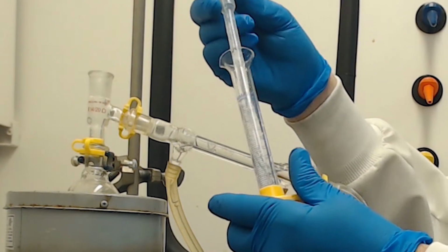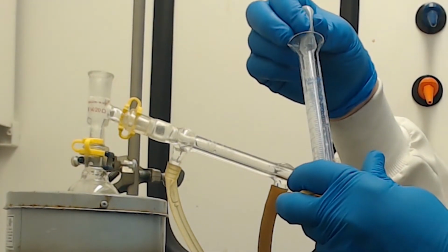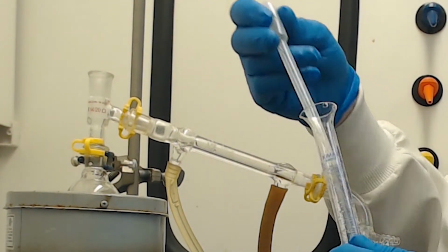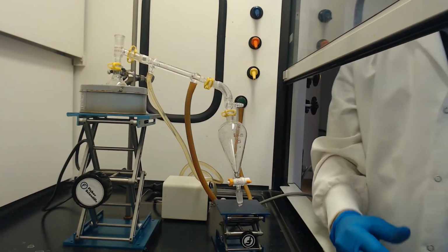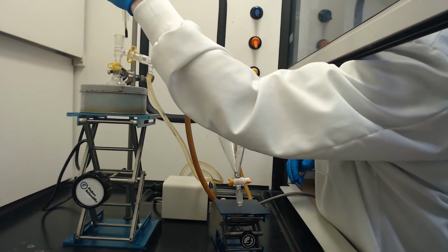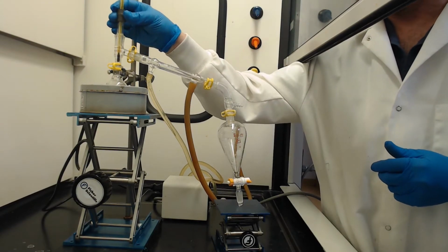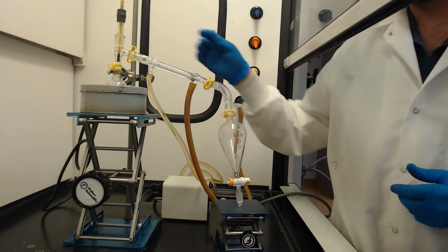This started off a little bit wet. This is 85% phosphoric acid, meaning it's 15% water. So we don't have to worry about totally dry conditions here. It is a dehydration reaction, which is driven by Le Chatelier's principle. But the key here is once we get the cyclohexene generated, we're going to heat it up and distill it right over. And you should have an idea of which one's going to have the higher and lower boiling point, the hexanol or the hexene. With hydrogen bonding in the hexanol, it should stay behind while this distills over.